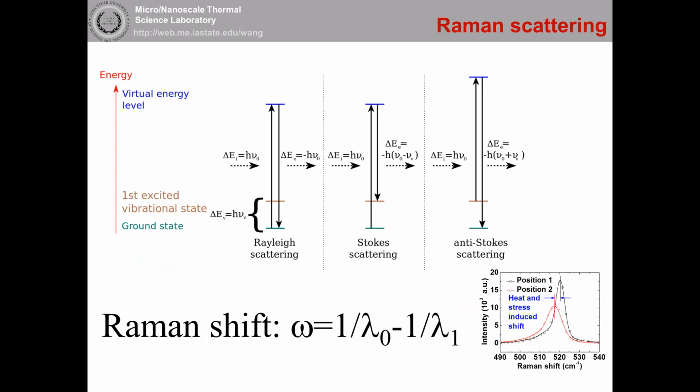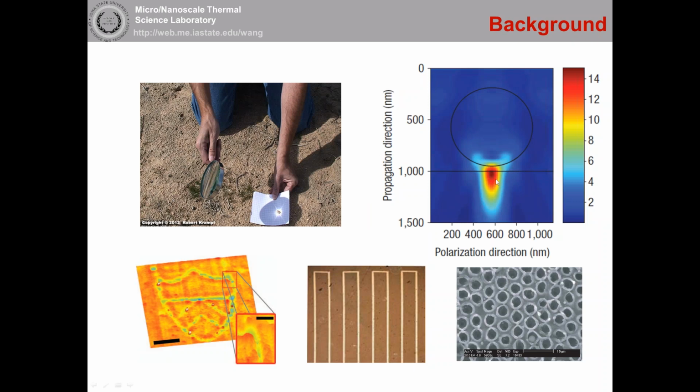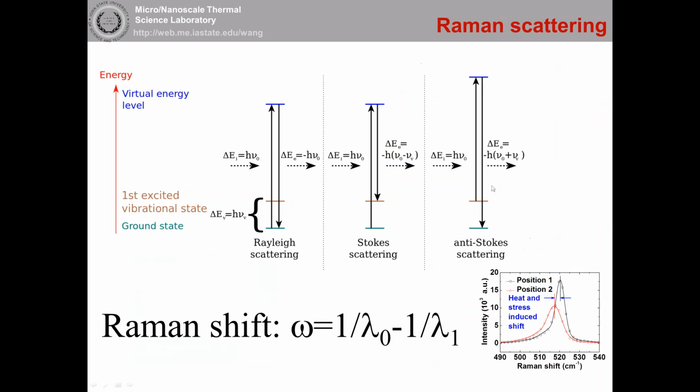It's very useful. But people know that if you focus the light, you can heat up the material, and it can melt. But nobody knows how high the temperature goes, because this area is really difficult to measure. You cannot put a sensor here. If your particle is on the top, it's really difficult to reach this area. So the first direction I will show is how we can measure the temperature in this tightly focused region.